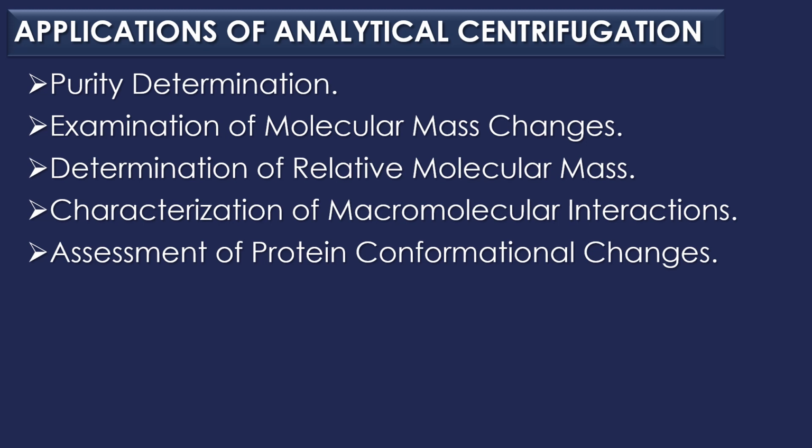The fourth application is characterization of macromolecular interactions. Analytical centrifugation enables the study of macromolecular interaction. By analyzing the sedimentation behavior of a sample containing interacting molecules, researchers can gain insights into the stoichiometry, affinity, and kinetics of these interactions. This information is crucial for understanding the mechanisms of molecular recognition, complex formation, and functional associations.